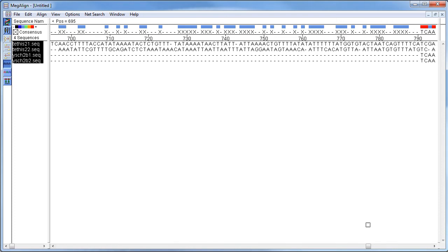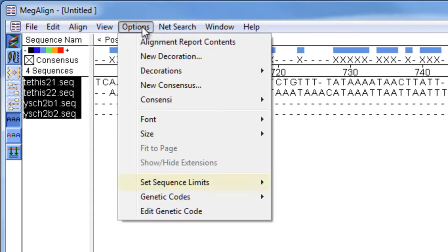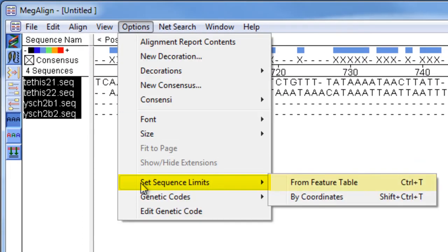In this case, all of my sequences are annotated, so I can limit the sequence ranges to a feature of interest. To do this, go to Options, Set Sequence Limits from Feature Table.